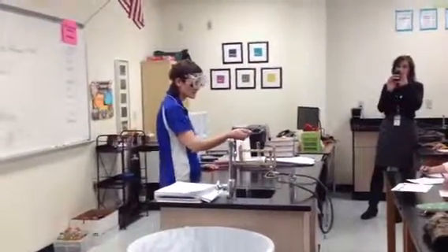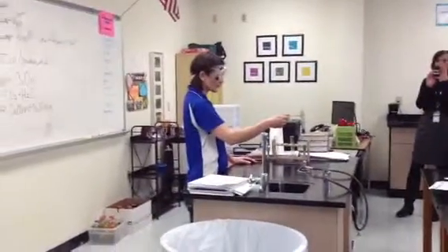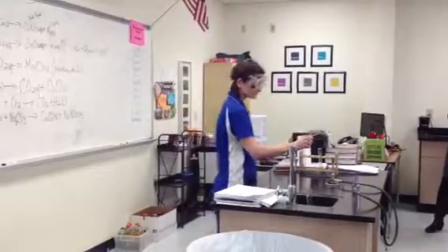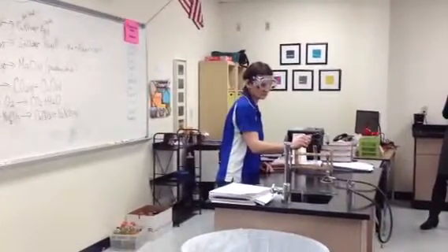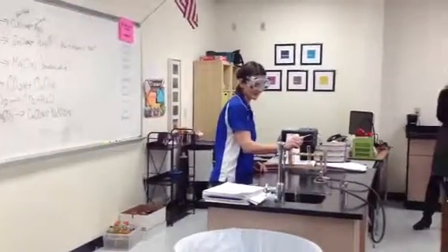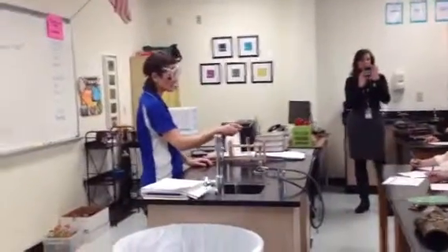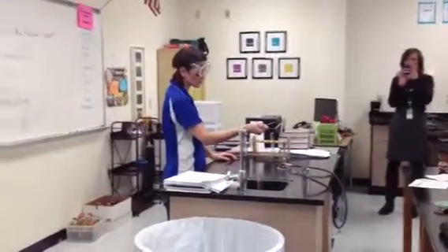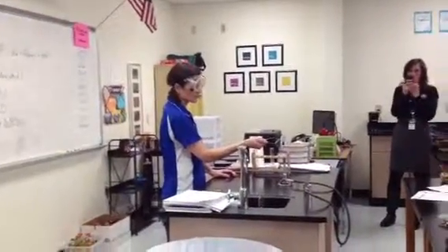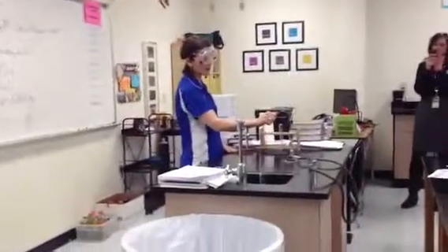Alright, do you see a product in the bottom of that test tube? Yeah, it's black. It's a black powder, right? Which product do you think that is from the board? Alright, you got it. The copper 2 oxide, right? Copper 2 oxide is the one we predicted to be a solid. Does anybody see a gas forming at the top of that test tube? What gas did we say that was going to be? Carbon dioxide.